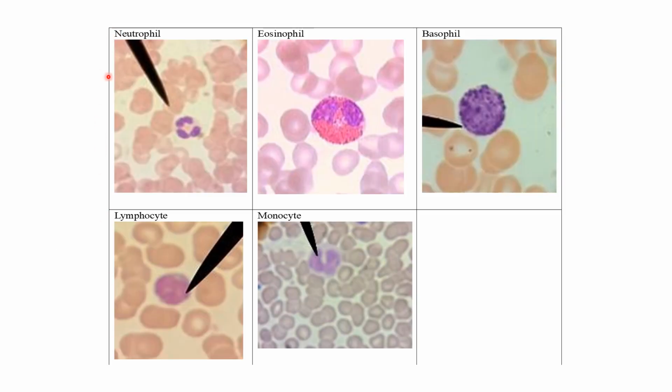All right, so now here is the view under the microscope. This is how a neutrophil will appear. Now let me orient you. These more numerous, lighter, pale red cells are RBCs. And this comparatively larger cell with multiple lobes and no specific color to the cytoplasm is a neutrophil. It is called a neutrophil because the granules are kind of neutral, they cancel each other.